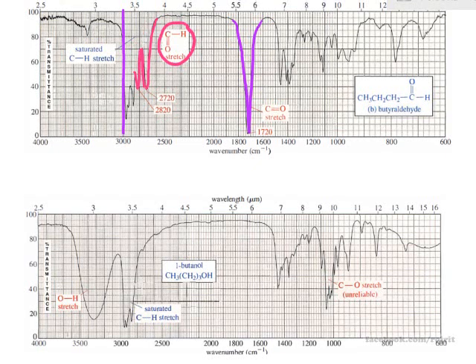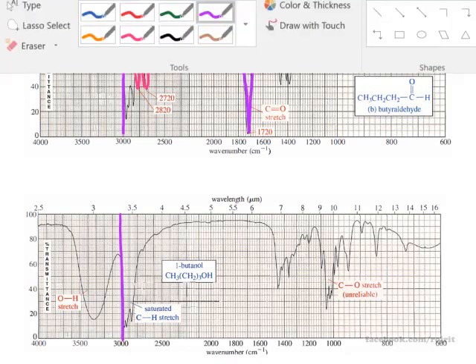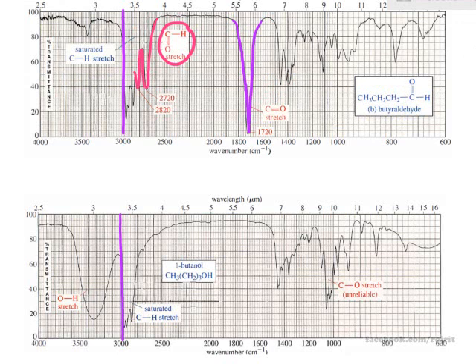Next, we come to the hydrogen bonding system. So go back to 3000. You have to mark the 3000 wave number to identify alkane, alkene, alkyl, or the unsaturation of the structure. But now, what you can clearly see here is a broad peak and very strong absorption.